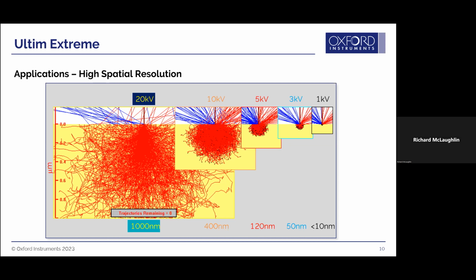You can see that at 20 kV, we're getting quite a few counts, 35,000 for the K series, 10,000 for the L series. And as we drop the accelerating voltage, all we end up with is the iron L peak to be used for the analysis. And we only get 1,000 counts per second. So it would be a very slow analysis if we were running under these sort of conditions with a standard EDS.